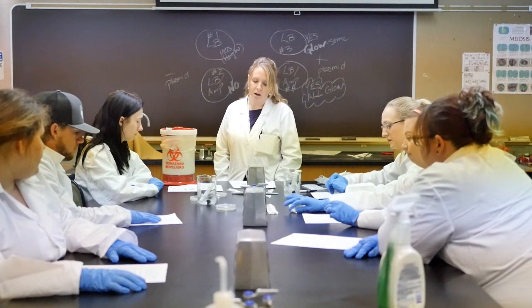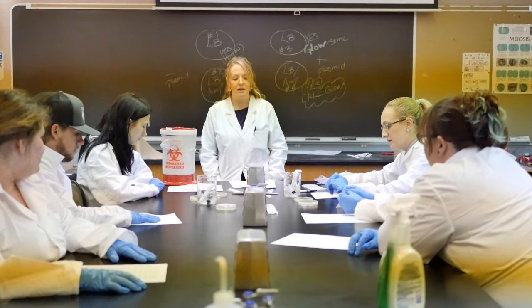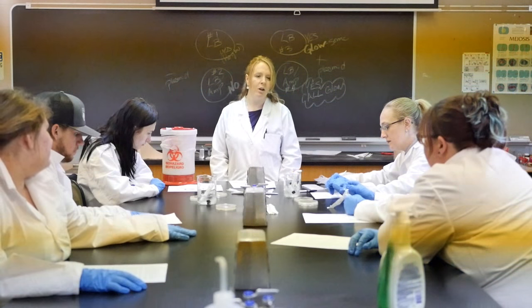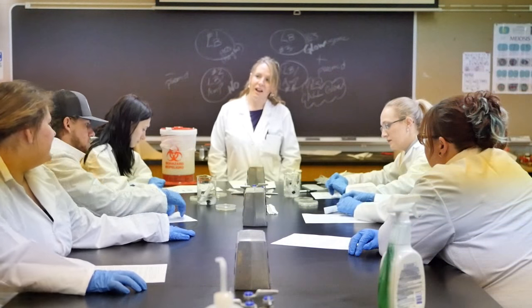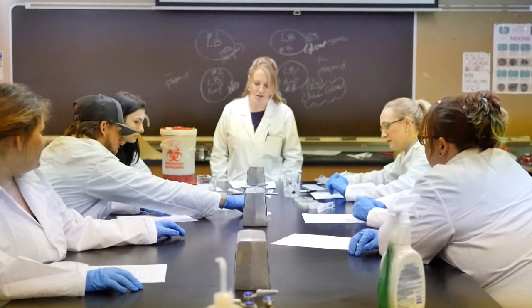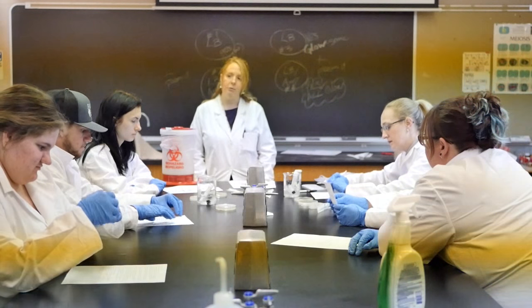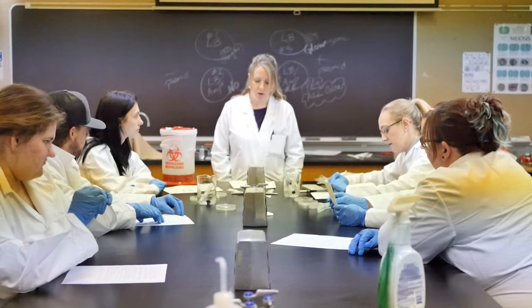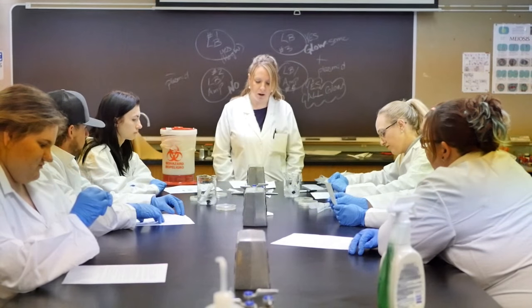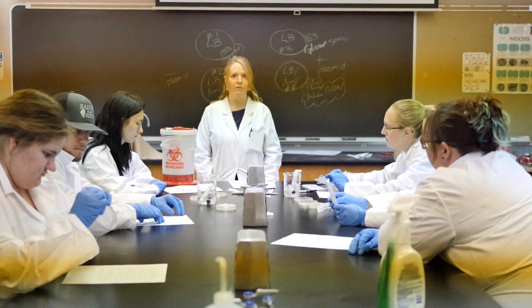Then we will let that come to recovery at room temperature, and instructions say 5 to 10 minutes, so we'll go a little bit over 5 minutes, maybe like 7 or something like that. So this will be the last downtime, incubation time while we're waiting. After that recovery at room temperature, we're going to be ready to plate it. So then we will be able to put a small amount of cells, 100 microliters worth of cells, onto each of the 4 plates that you have.